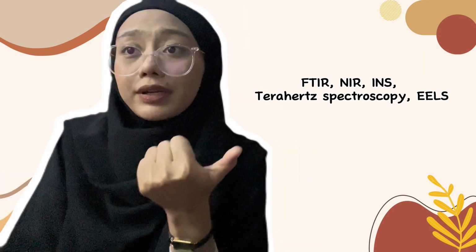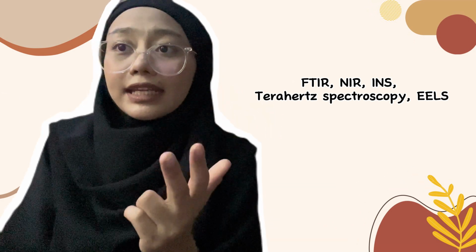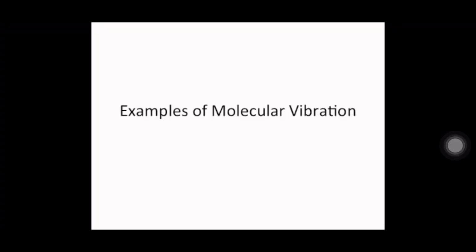Some of these techniques include Fourier transform infrared spectroscopy (FTIR), near infrared spectroscopy (NIR), inelastic neutron scattering (INS), terahertz spectroscopy, and also electron energy loss spectroscopy (EELS). Here we show 5 vibrational modes using carbon dioxide and methane.